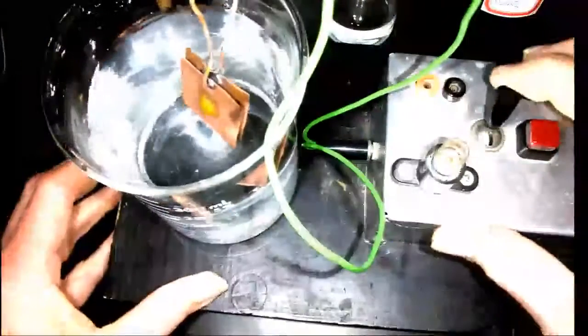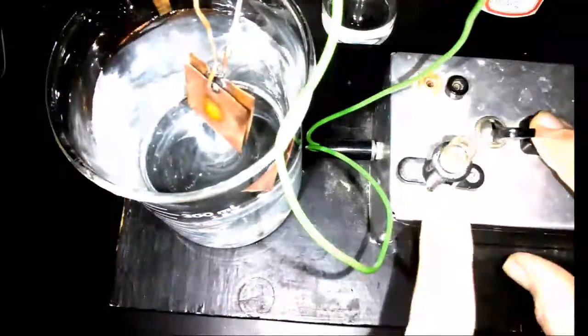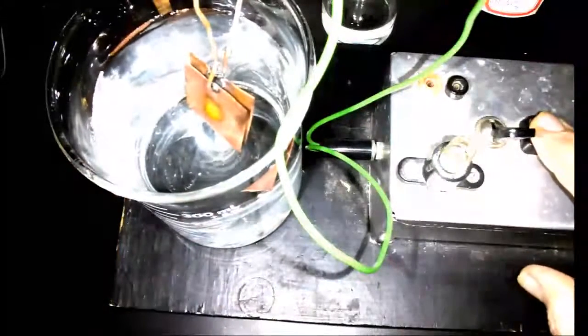All right, it's time for a demonstration of an acid-base reaction and how electrolytes are related to these reactions. I'm using a low-tech conductivity apparatus with a little pair of copper electrodes separated by a little spacer, which you can see here. When I immerse these into distilled water in the beaker, nothing is going to happen if I turn the switch and push the button. The light bulb has no glow. All right, so that's what we're expecting with water.